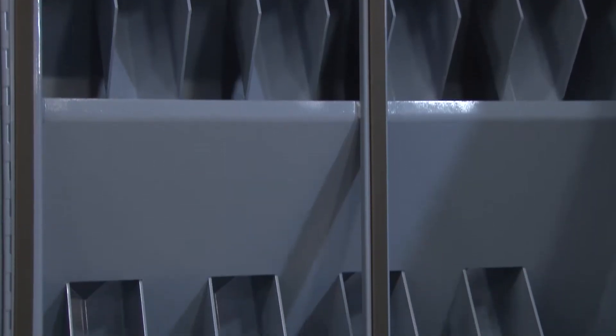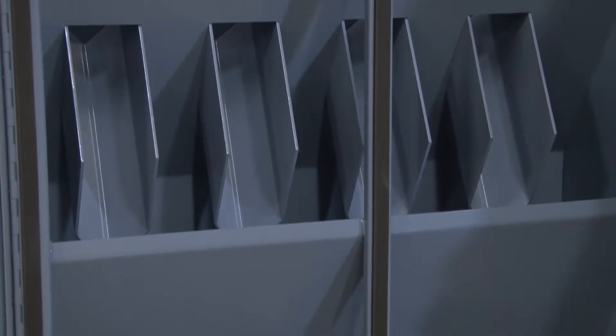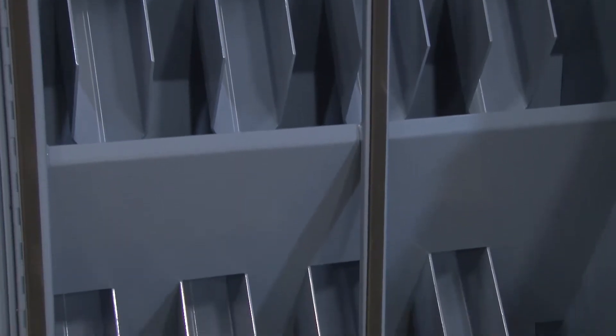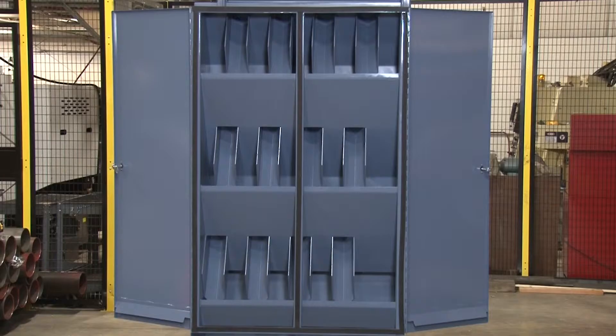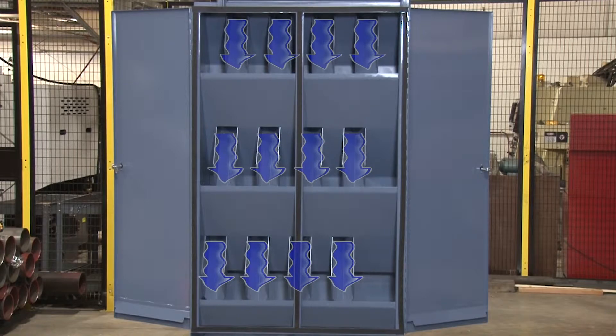At each stage, half the material is directed into a reject pan and the other half continues to the next stage. A one-stage operation yields a one-half split, a two-stage operation yields a one-quarter split, and a three-stage operation yields a one-eighth split from the original bulk sample.